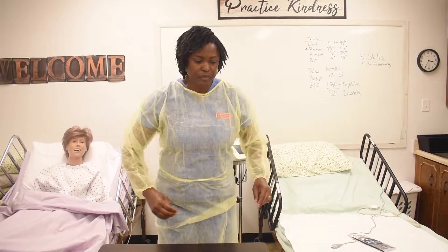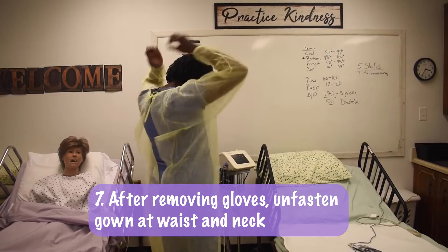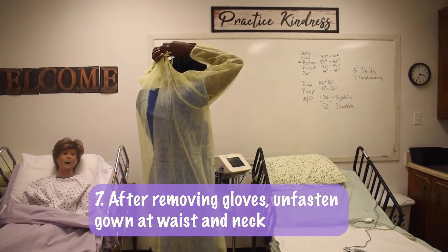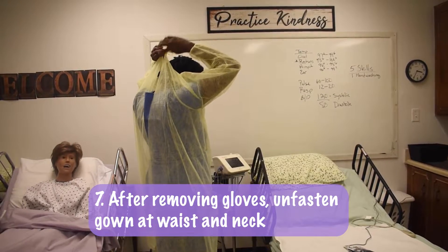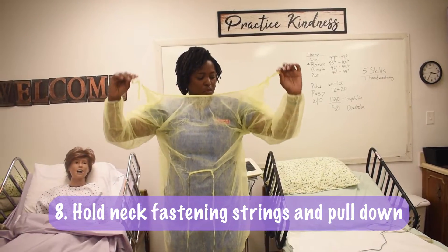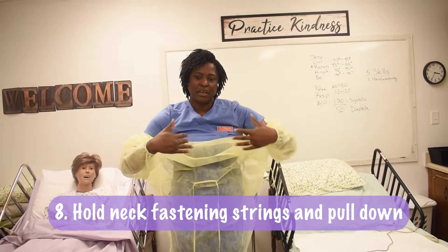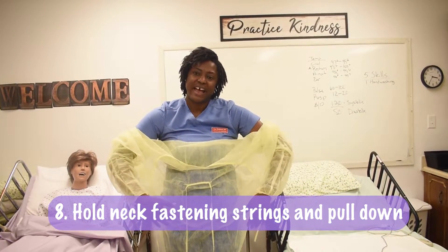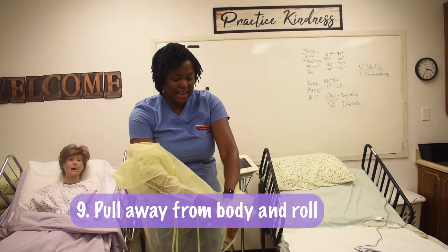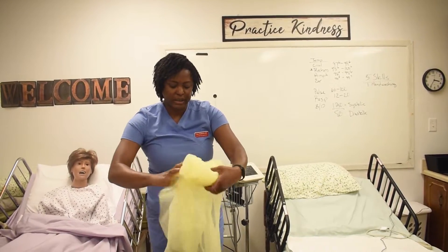Dispose our gloves. We take loose at the bottom and then at the top of the gown. Hold your two strings and pull down. Now we can touch the inside because the inside is clean, but our outside is dirty. Pull it away from the body and roll it.